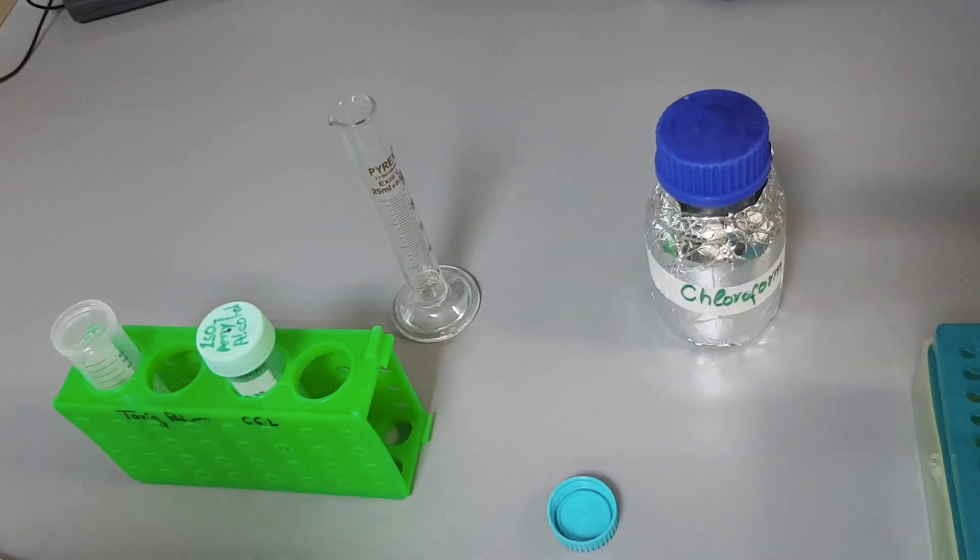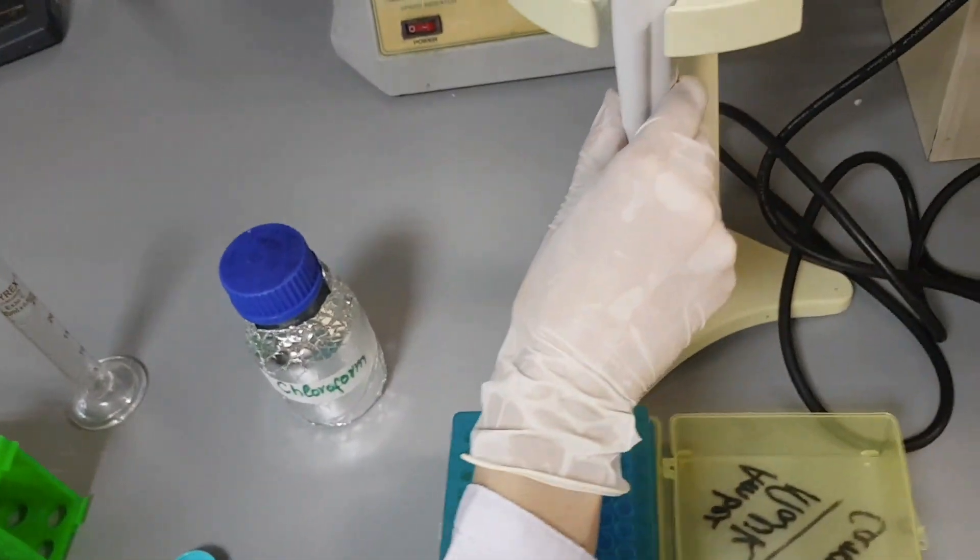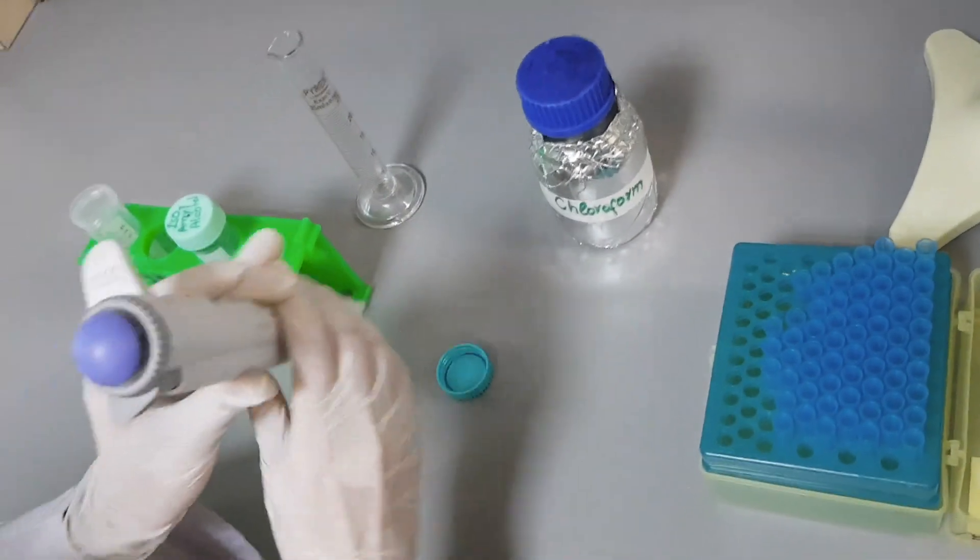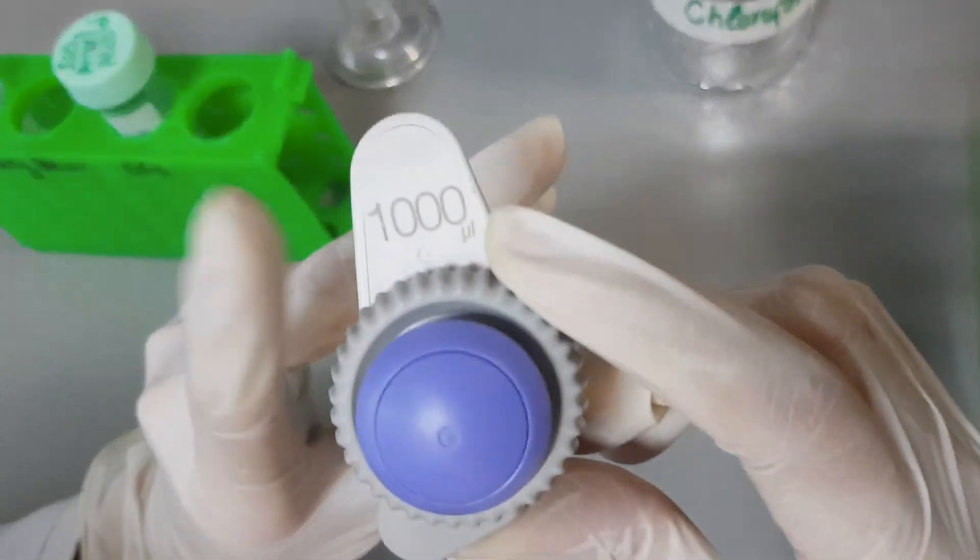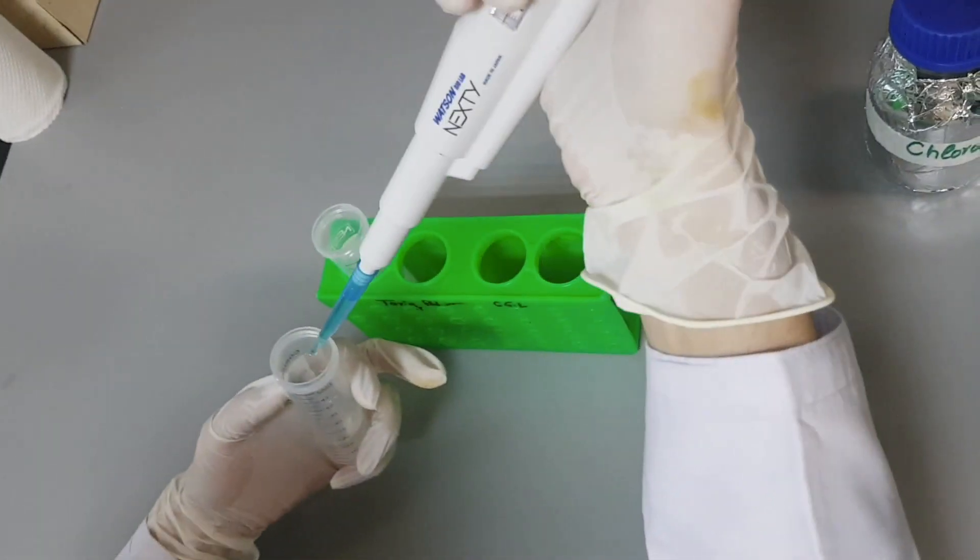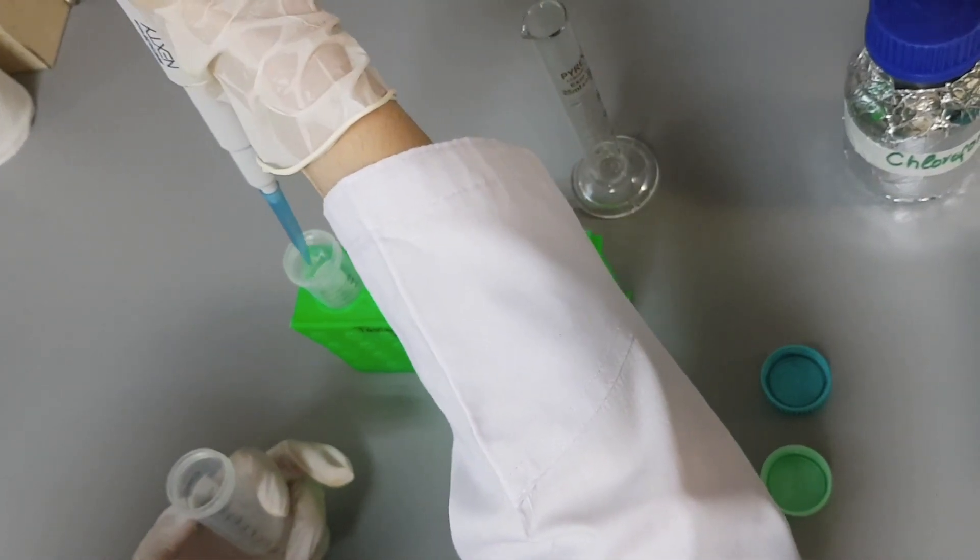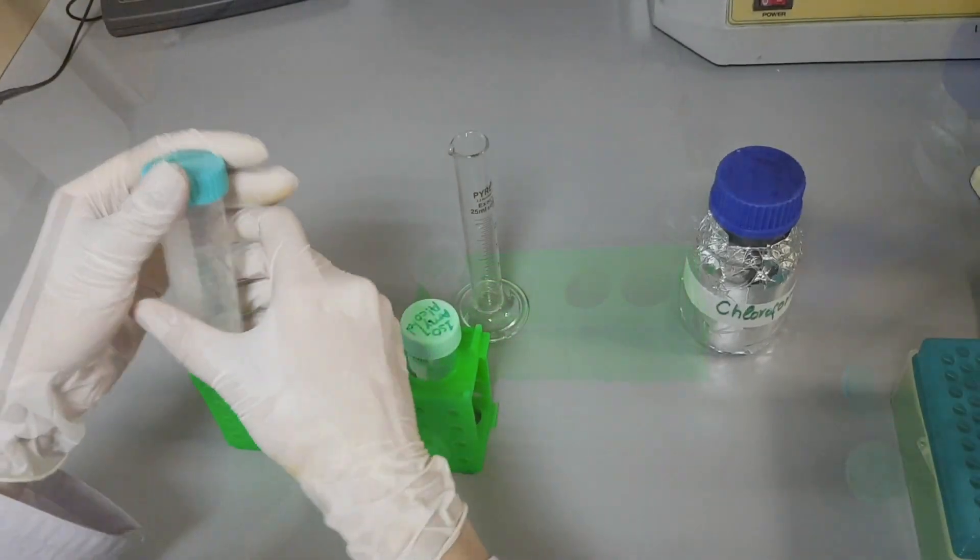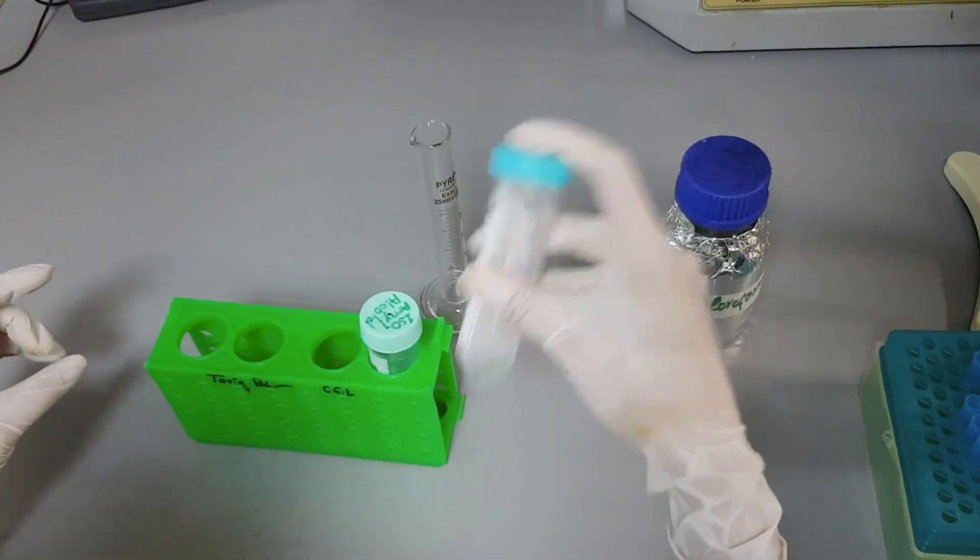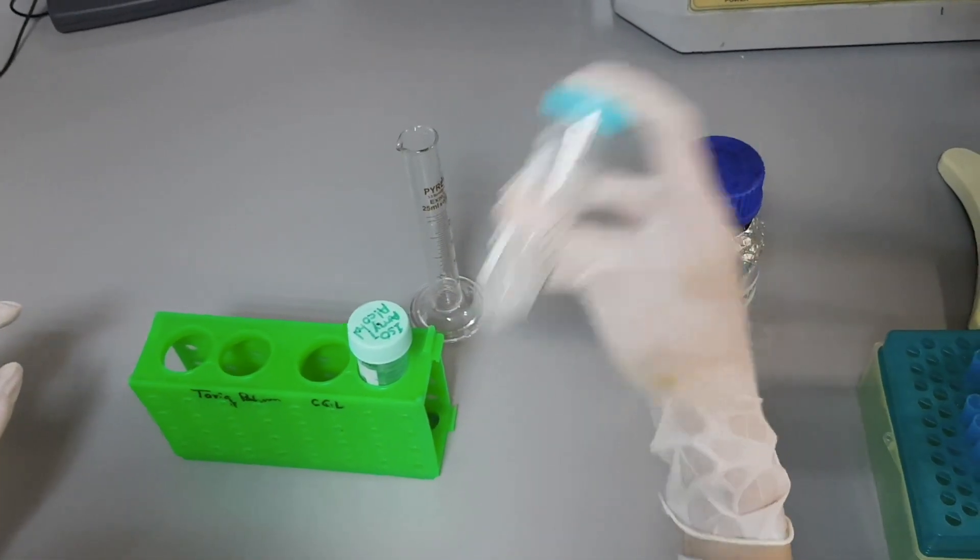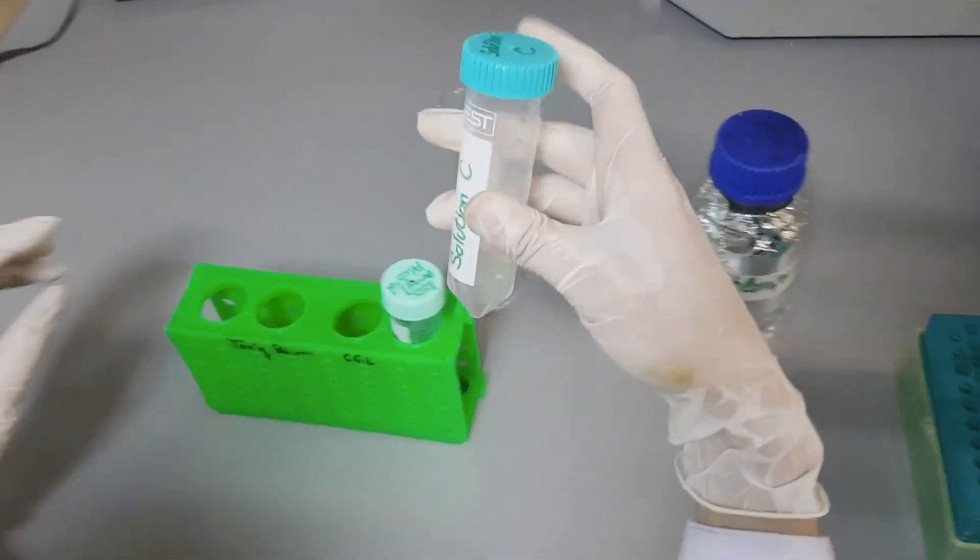Now take 1 ml of isoamyl alcohol by using a 1000 microliter pipet and pour it into the chloroform containing falcon tube and mix it well. Now solution C, which looks transparent, is ready to use.